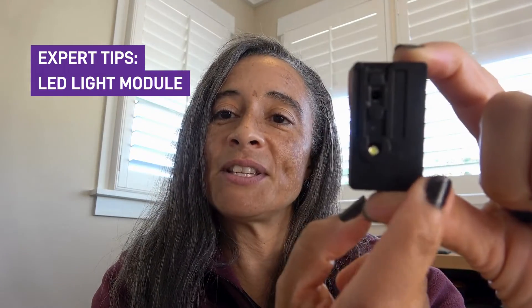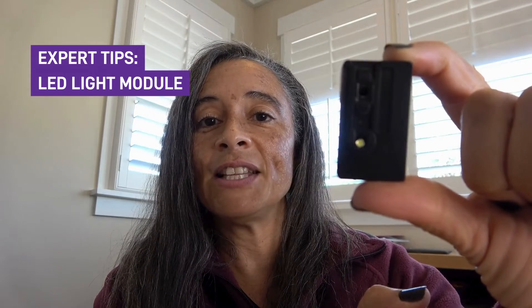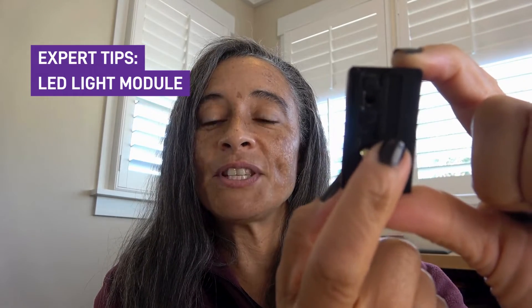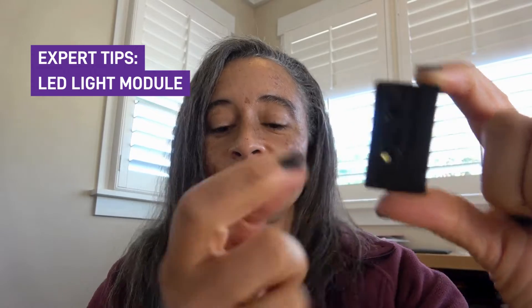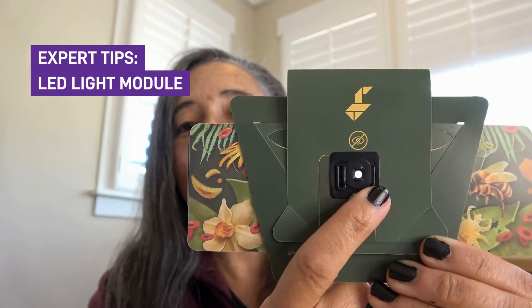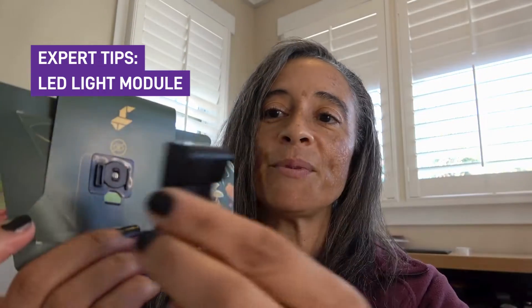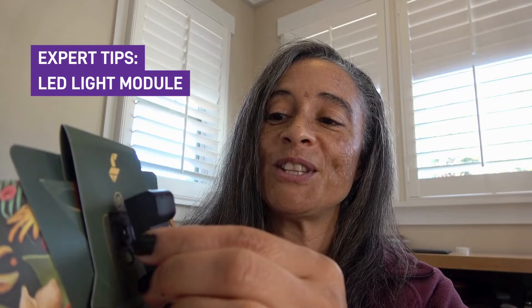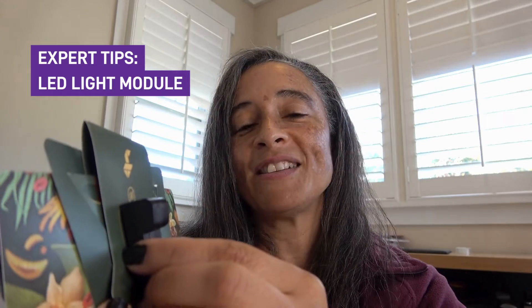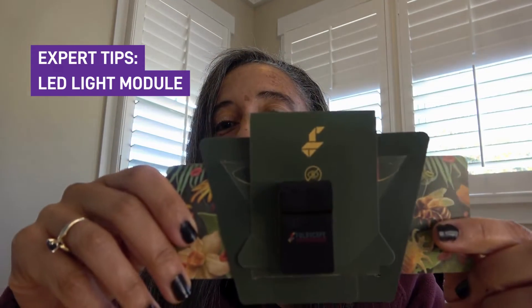The other thing I want you to take notice of on the back of your LED light module are the two rectangles that are on either side of the lights. You'll notice that one rectangle is thicker than the other. If you look at the back of your Foldscope 2.0, you'll notice that there's a similar set of rectangles with one being thicker than the other. This is to help you line up your LED light module with your Foldscope, so that the thick rectangle matches the thick and the thin rectangle matches the thin, and it magnetically attracts — now you have your LED light module on your Foldscope.